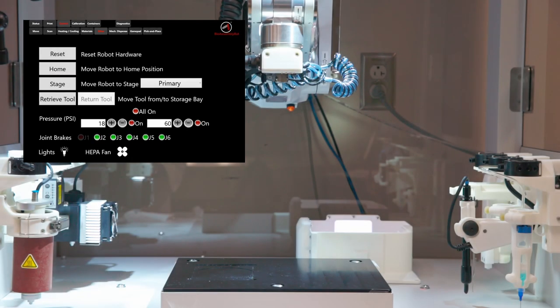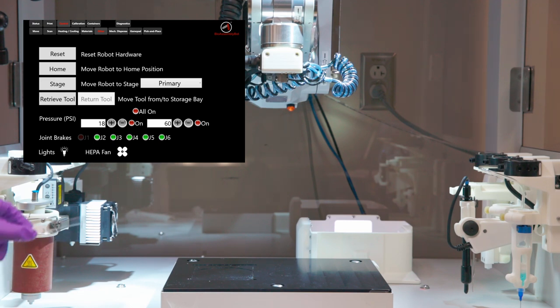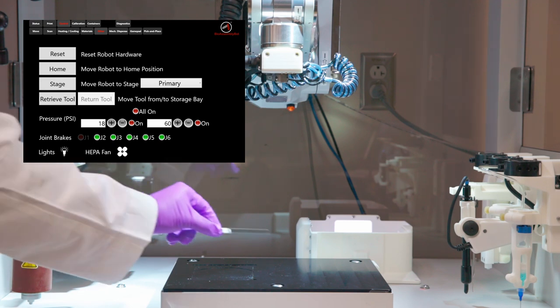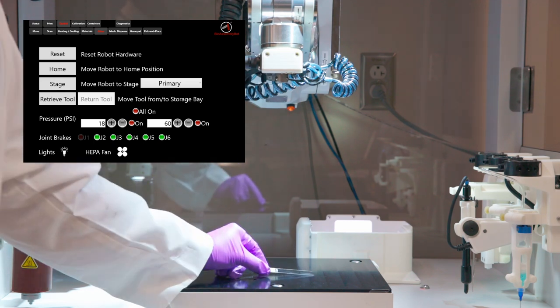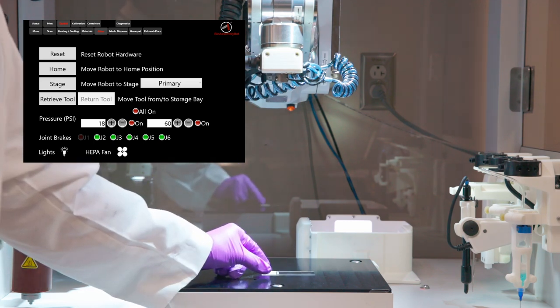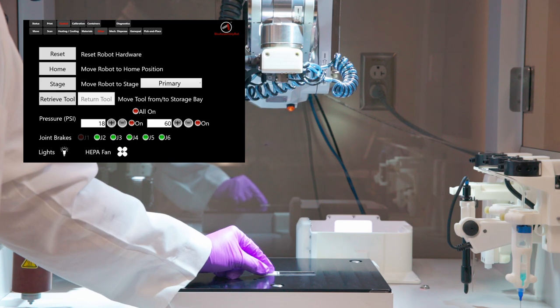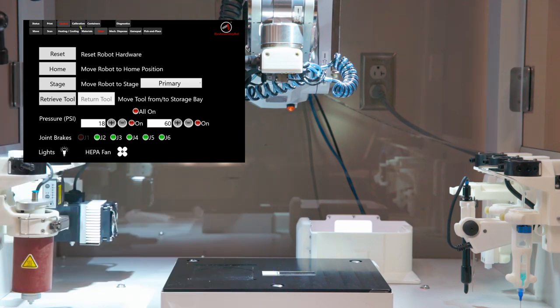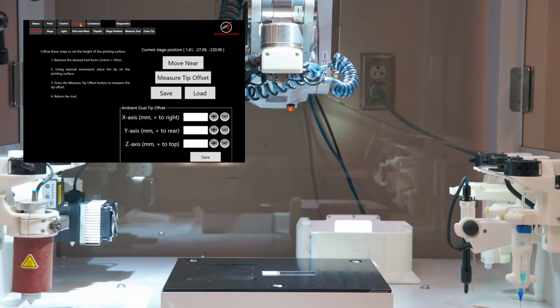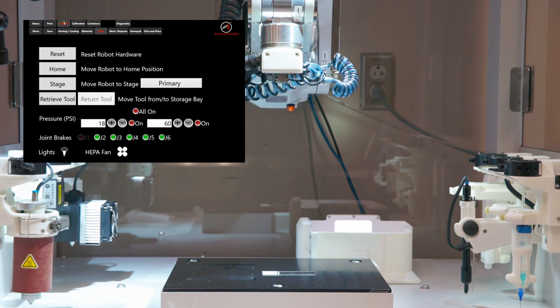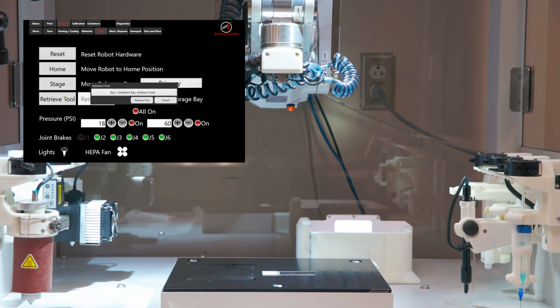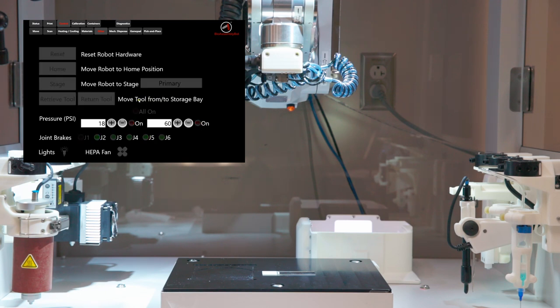Click on return tool and choose the bay one for ambient tool and click return. Now we will be printing on a glass slide. Place the glass slide or appropriate print surface on the stage. Now click on calibration menu. Click on tip offset. Here we are going to measure the tip offset by following these instructions. Go to control menu and click on other and retrieve the tool. Select the printhead we will be working with and click retrieve tool.